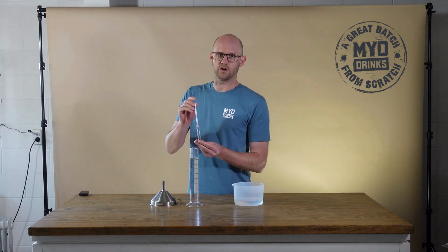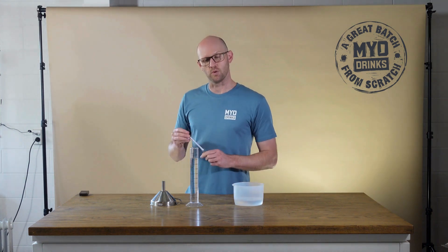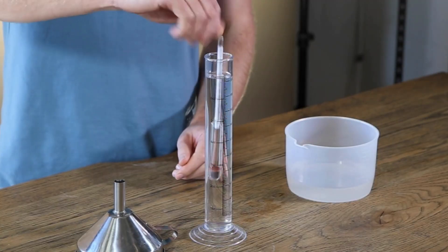A good tip when you add your alcometer into your liquid is to give it a spin. That's going to release any air bubbles that are potentially sitting on the alcometer itself.